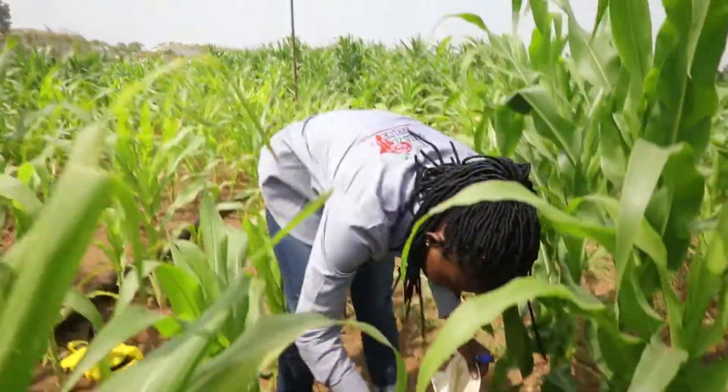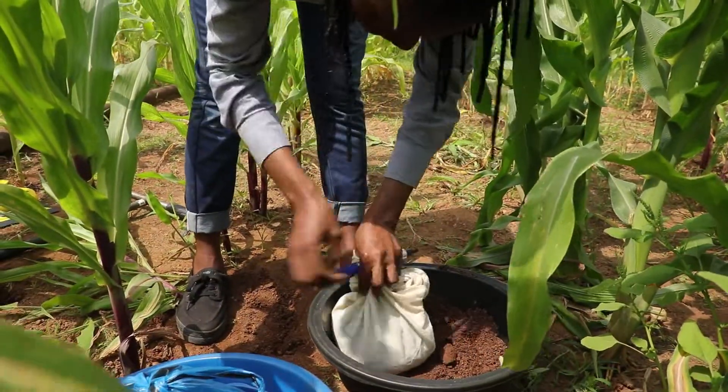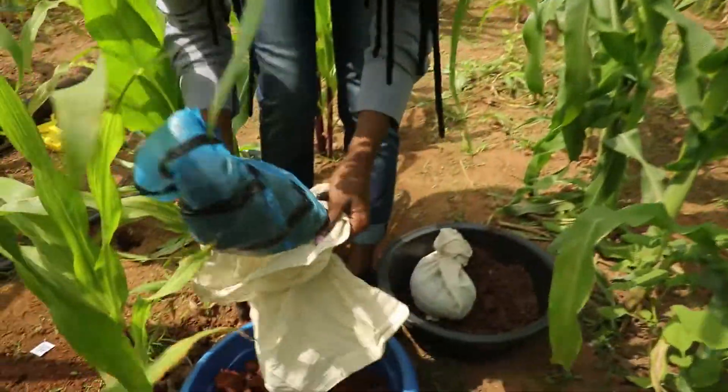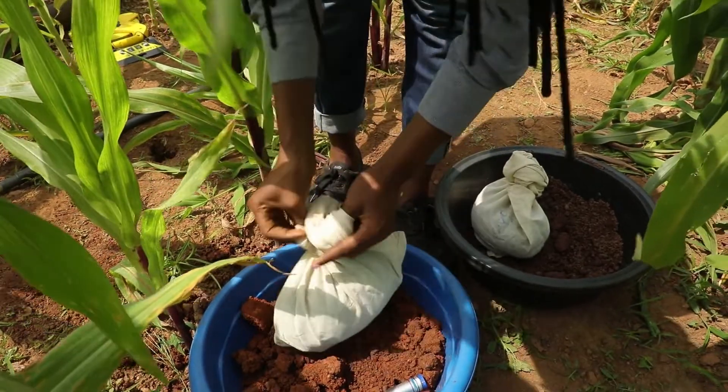Now put the plastic bags with the soil samples into the cloth bags and tie them — staple them if possible. The plastic bags serve to preserve the moisture in the soil sample, while the cloth bag is used to provide sturdiness.